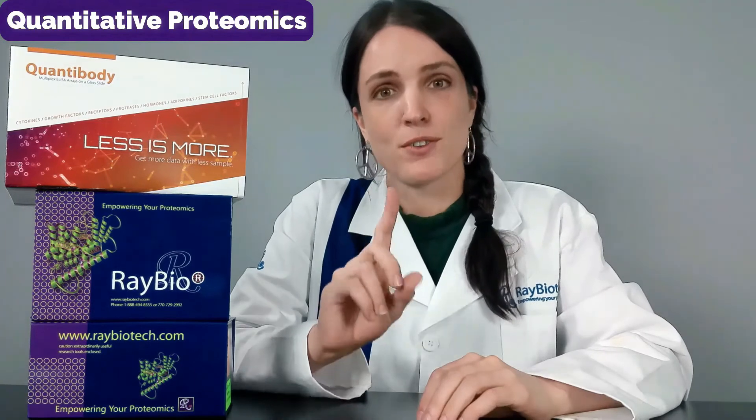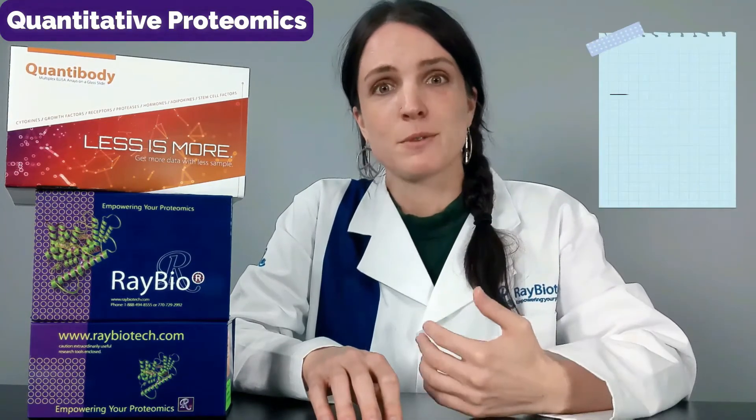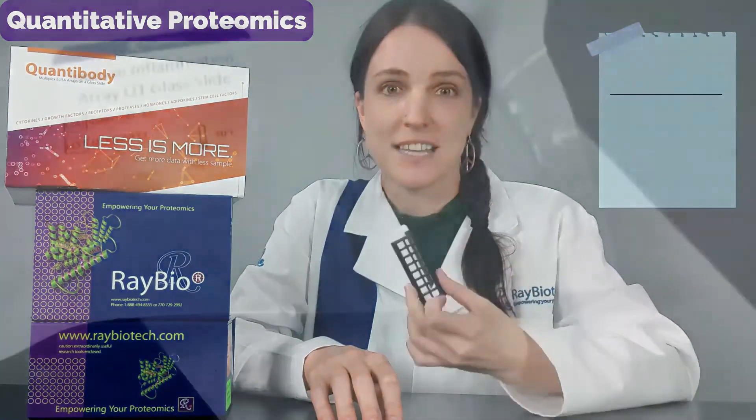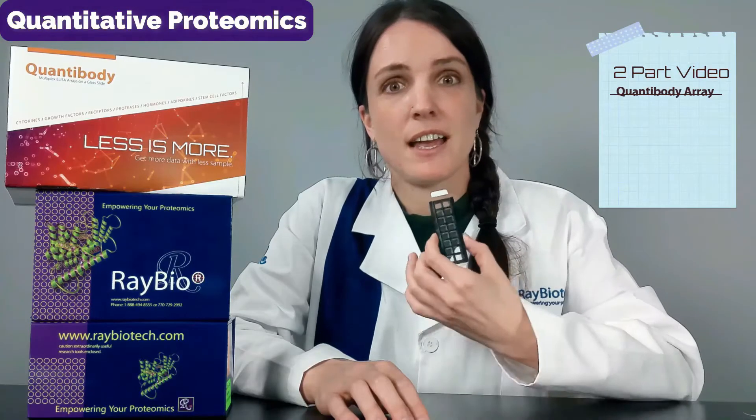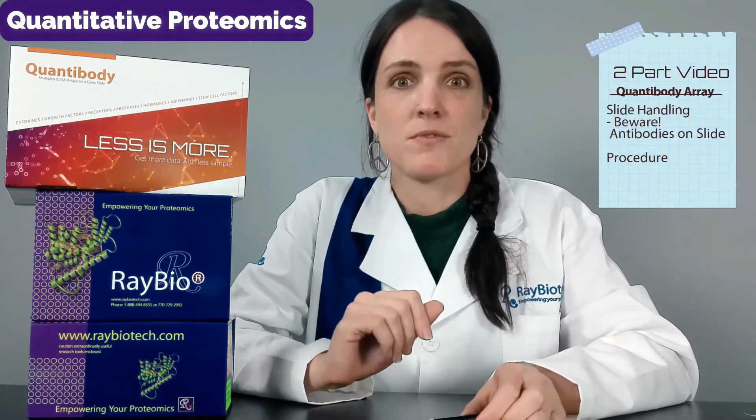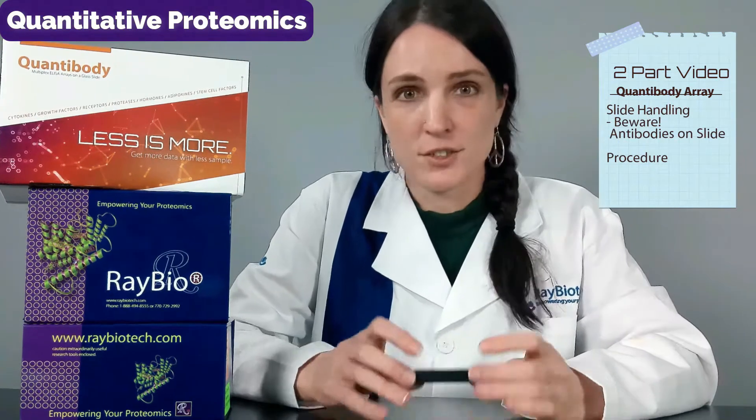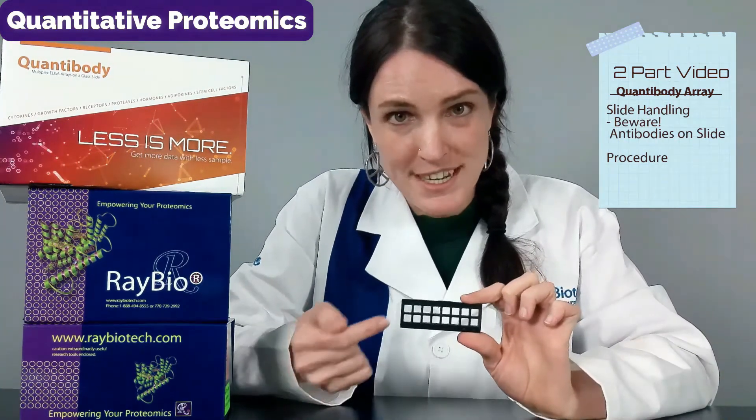This video comes in two parts. The first part is what I as a former basketball player like to call working on your slide handles. My friend Brett is going to tell you the best way to handle these slides in a way that maximizes your throughput and minimizes error. It is crucial that you do not mess with these printed antibodies.